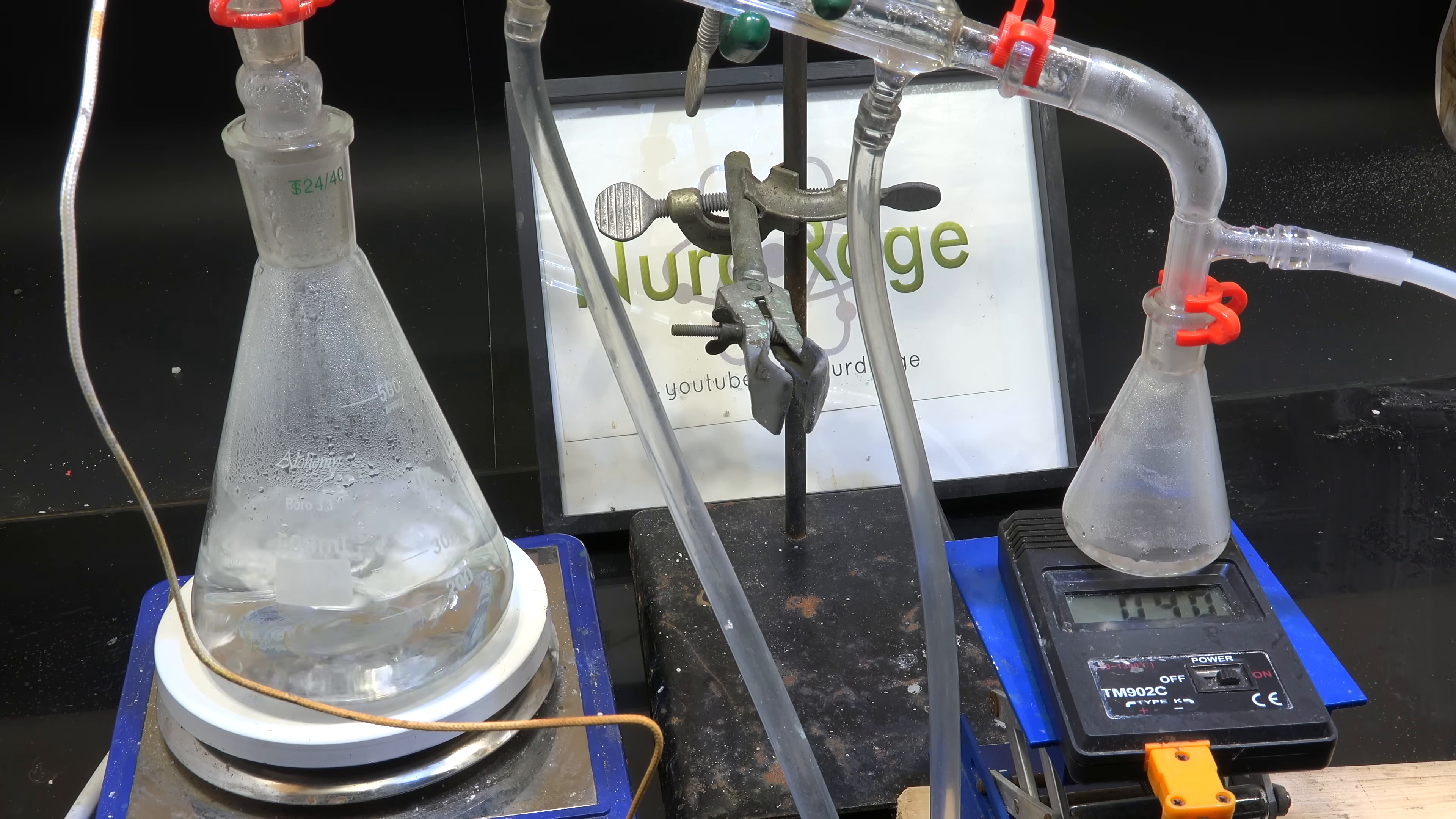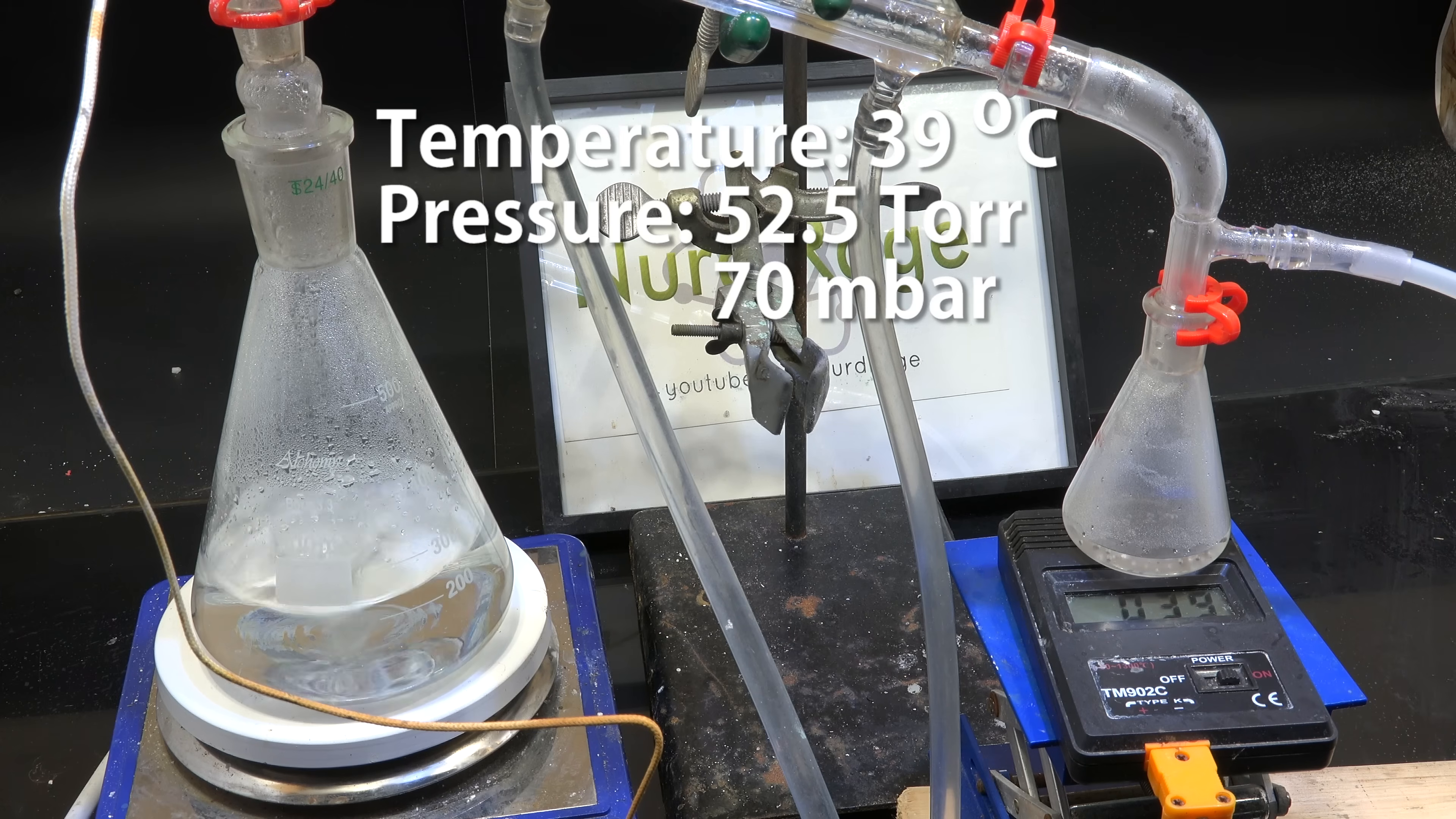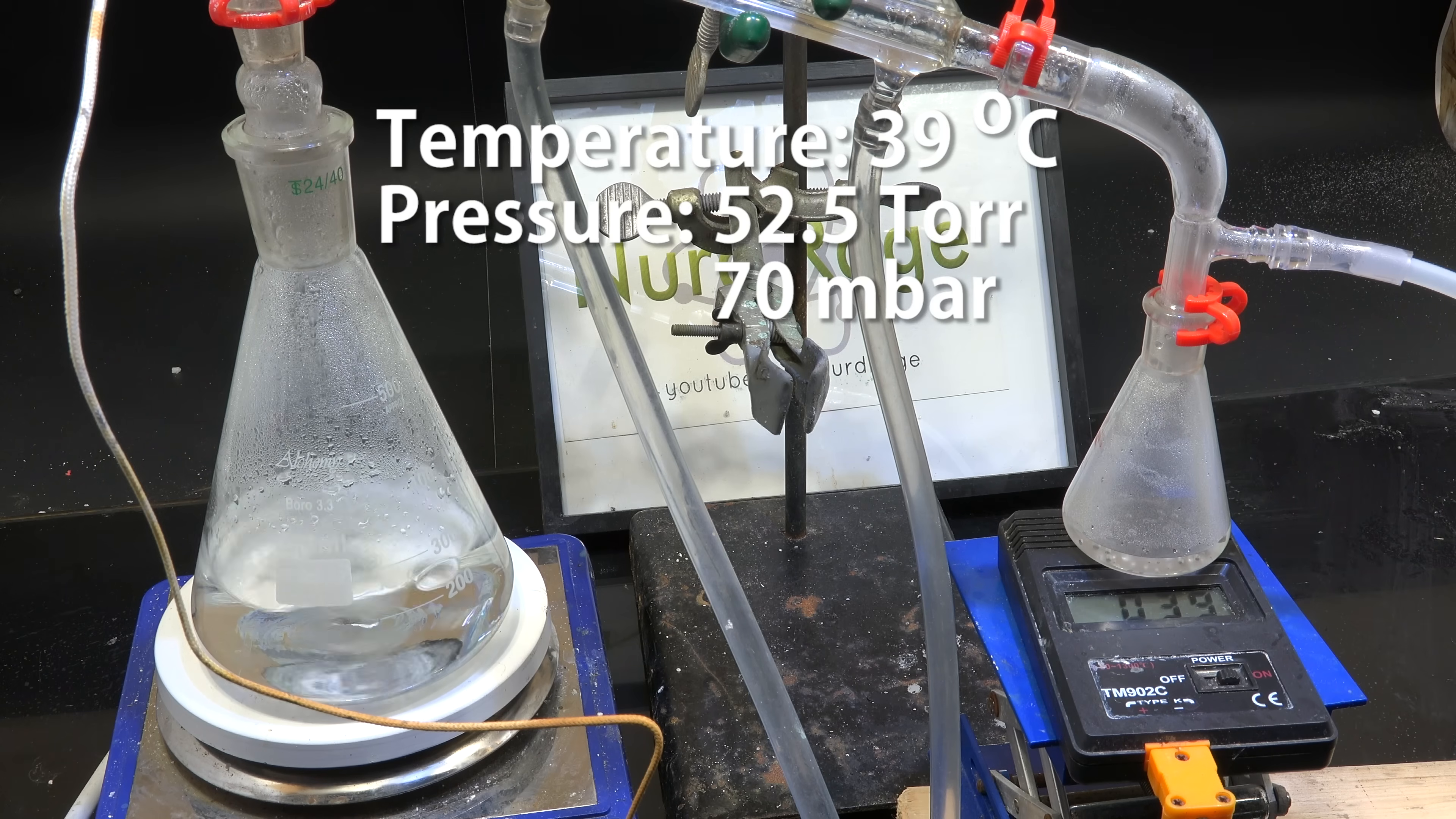We can actually calculate the pressure based on the boiling point since the properties of water are well known. To boil water at 39 degrees celsius the pressure inside the apparatus must be at around 52.5 torr or about 70 millibar.